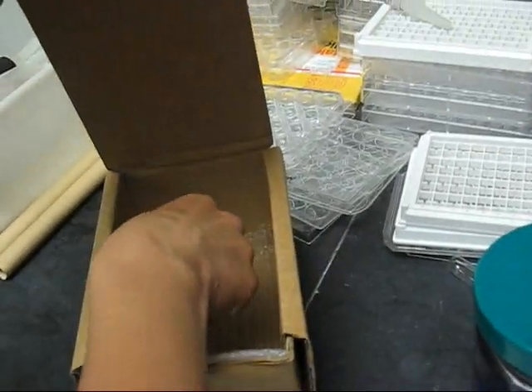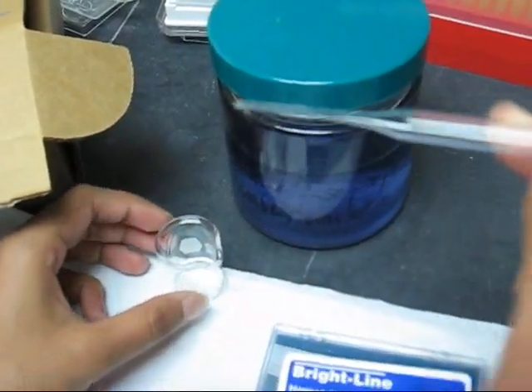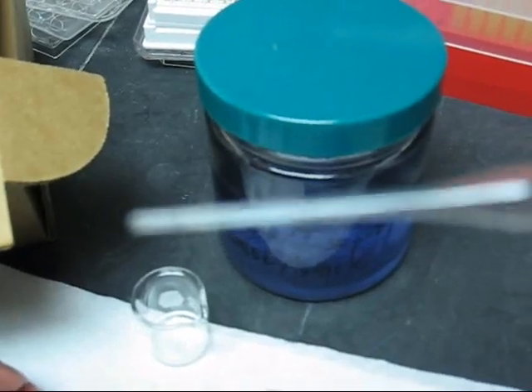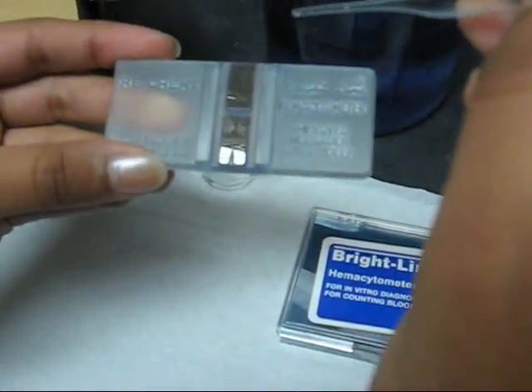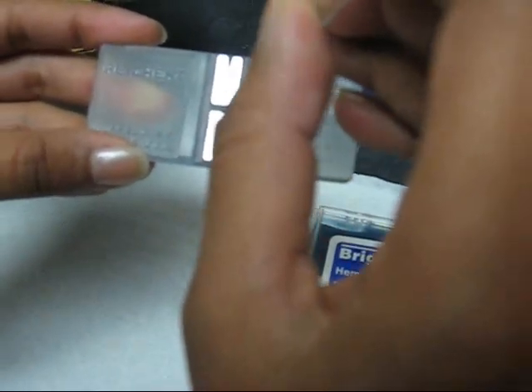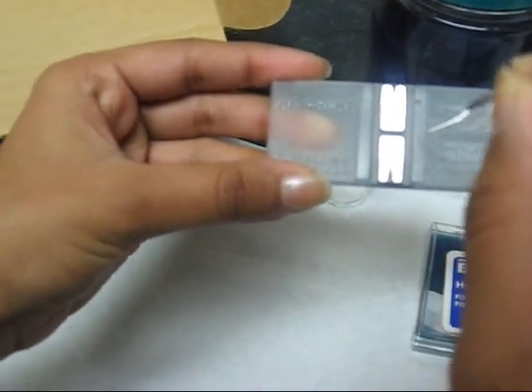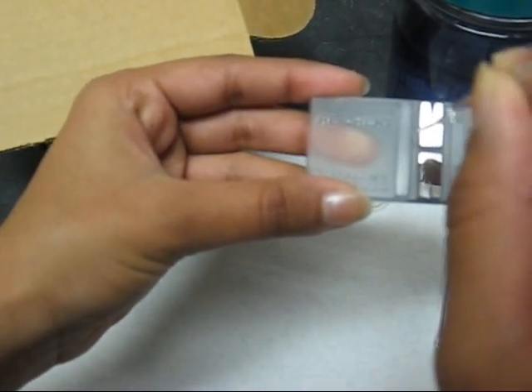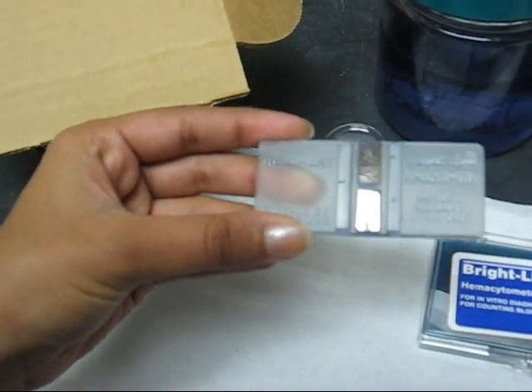Then take a Pasteur pipette and dip it into the water, and you will have just enough water to put it on the slide plate. Be sure not to put too much water or the glass slide may slide off. Three droplets should be enough.